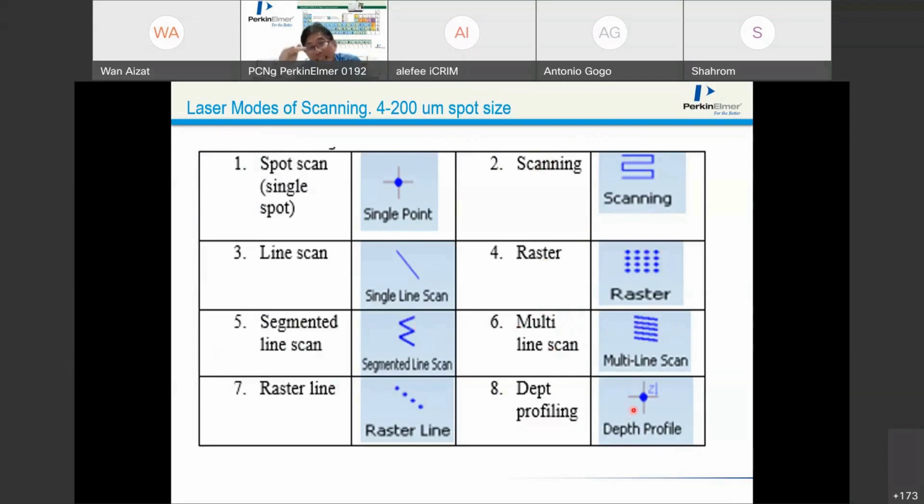It can study the coating or the depth. Different depth, different element, different composition. For coatings, you can study them. After the first layer comes up, you know the second layer, meaning the material is continuously shot, and then it will be a coating.